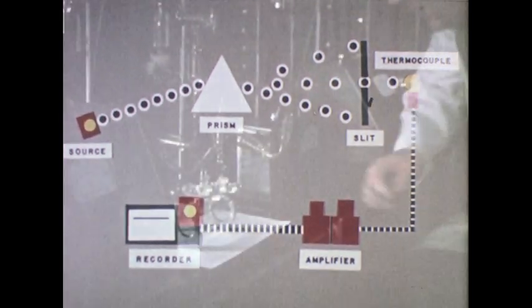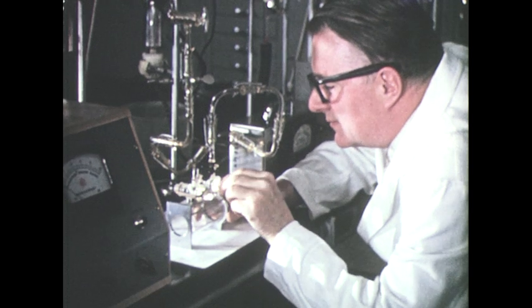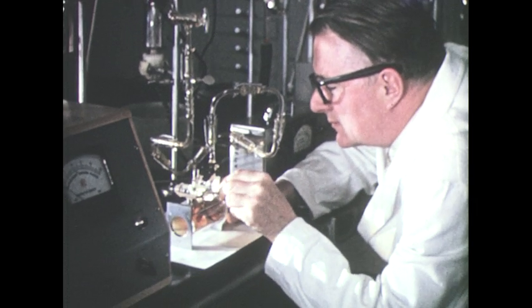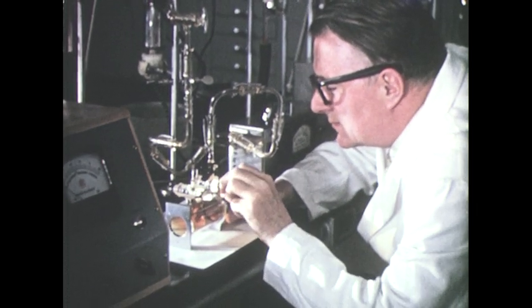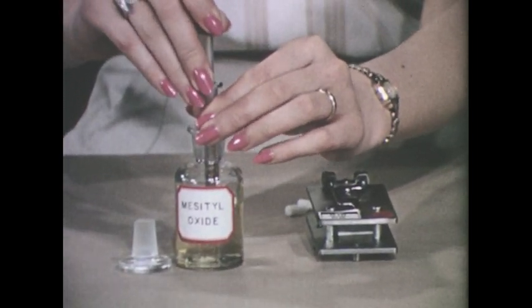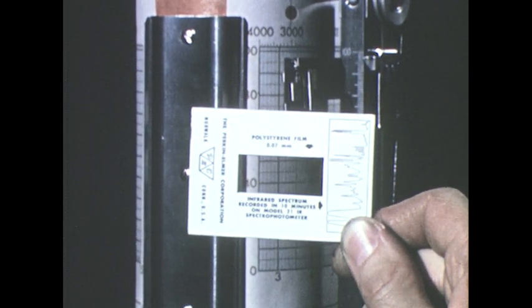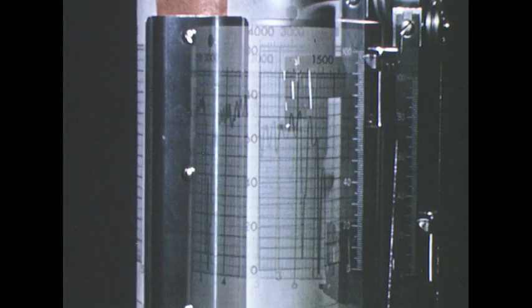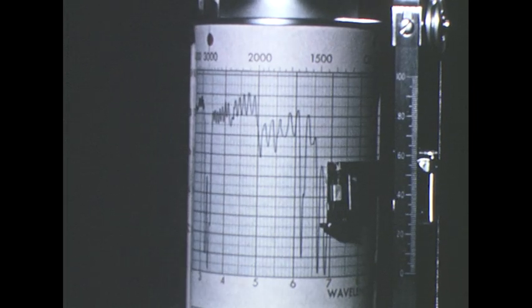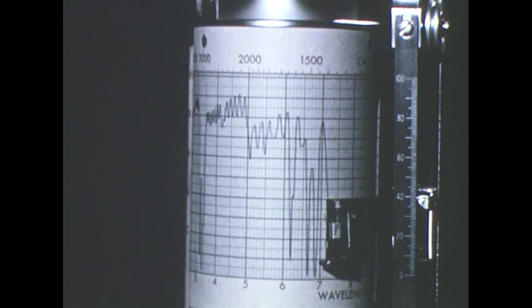Techniques will be shown for handling gases, liquids, and solids. Finally, the importance of infrared spectroscopy in analysis and industrial research will be presented.